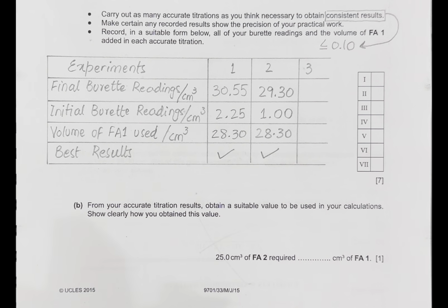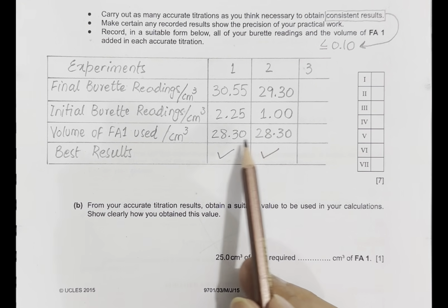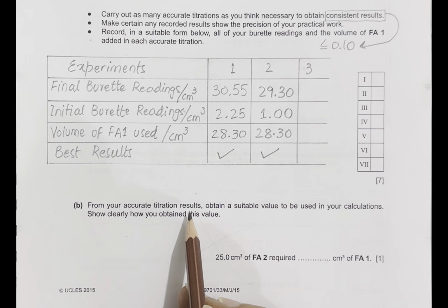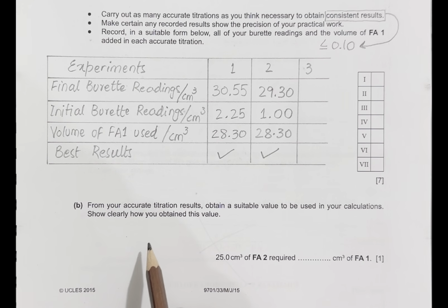Now, let's move on to the next part, which says, from your accurate titration results, obtain a suitable value to be used in your calculations. Show clearly how you obtained this value. We got two readings the same. It means we can write the average of these two, that is the mean value to be used here. These two values will be added and divided by 2, and we need to write this here.